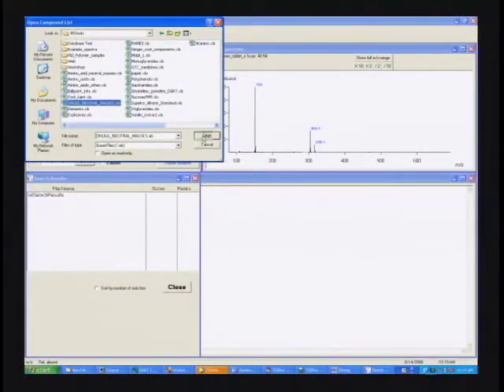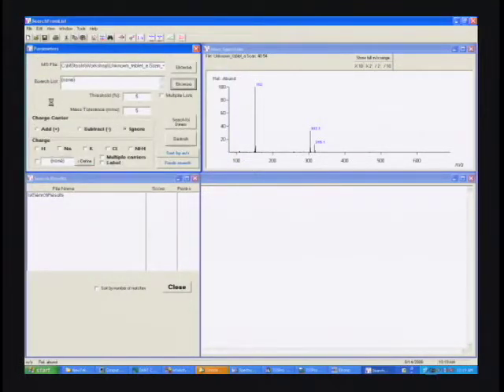right here, probably several hundred drugs and their elemental compositions saved in an Excel spreadsheet here. As soon as the program finishes loading the drug list, we'll ask it to go through the mass spectrum and just name what it finds.